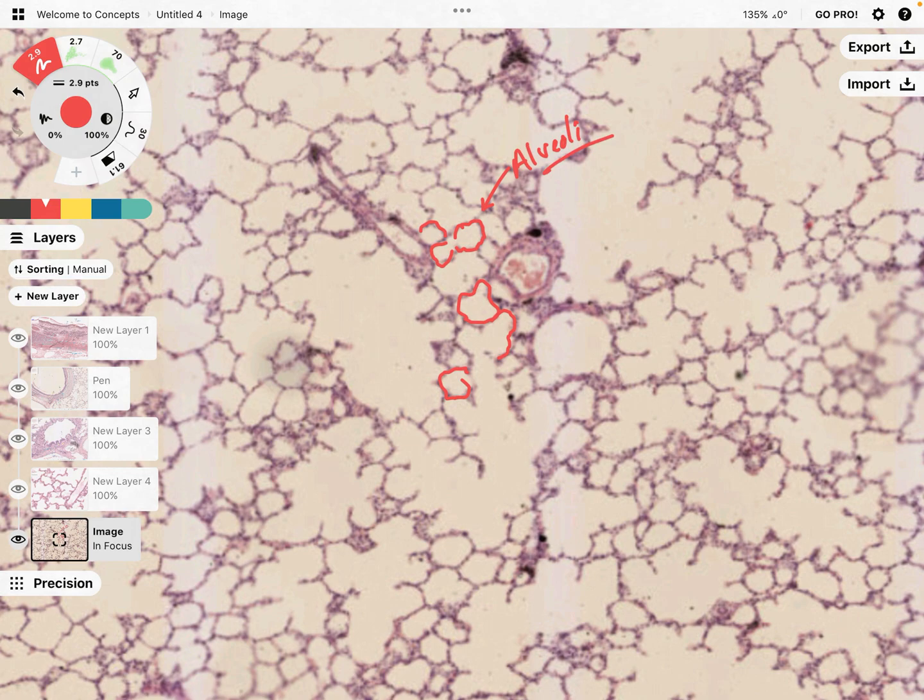A lot of what we're seeing, obviously, if you can envision, this is a three-dimensional structure, but we're seeing it two-dimensionally, so a lot of things get cut off, smushed, mashed, etc. So it may not exactly look like how you would expect it to look in a three-dimensional model or view, but at least we can see a lot of these structures.